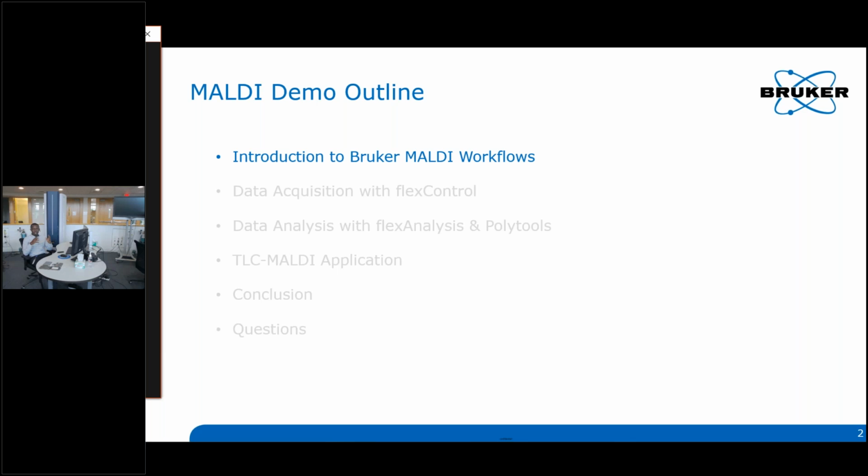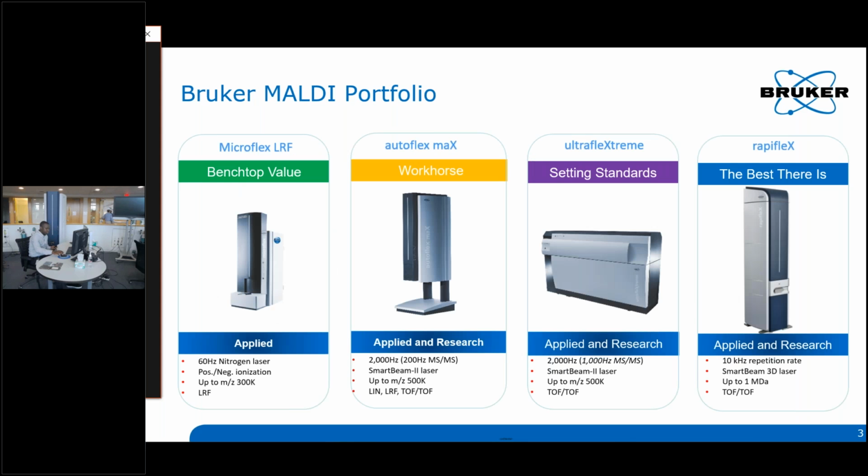So we'll go ahead and acquire some data, use the acquired data and process it through every software that we go through and use, and just show you all around and everything that we do for polymer analysis. So just a quick demo around what we have.